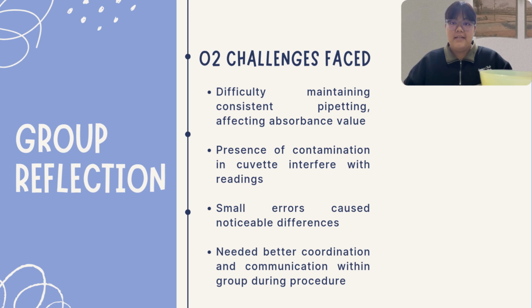Secondly, one of the main challenges we faced was maintaining accuracy and consistency throughout the experiment. Small variations in pipetting technique or sample preparation could lead to noticeable differences in absorbance values. We also realized that factors such as improper cleaning could interfere with light transmission and affect the readings. In addition, coordinating tasks within the group required effective communication, as any misstep in procedure could impact the overall results.